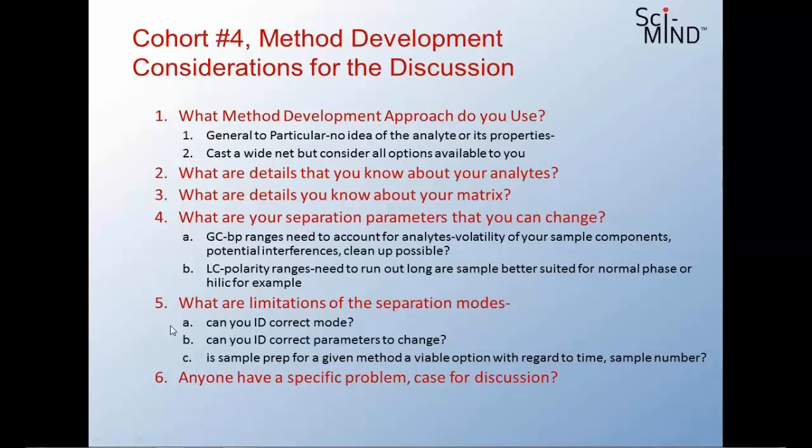Well, that's good to know. I wonder if Nick Snow is still online, because I'd be curious to know if any of these things would work with the SPME technology that he had mentioned. I always had problems with, and I'm not as familiar with using a cold finger, but if you have to run a series of analytes that go from really low temperature to really high temperature, the difficulty in the length of your run is that it has to re-equilibrate or come back down. But if you're using a cold finger trap and then introducing it into the inlet, that might be... no, it's not really a cold finger type.